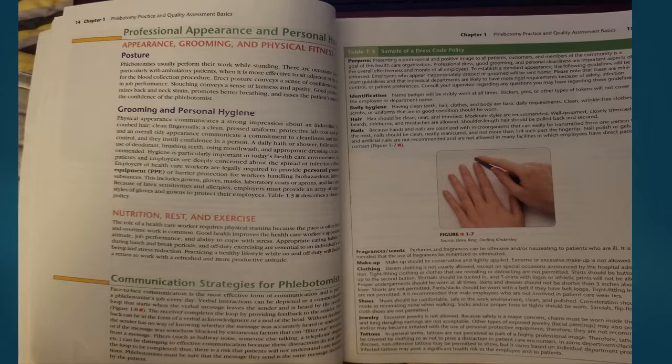This includes gowns, gloves, masks, laboratory coats or aprons, and face shields. Because of latex sensitivities and allergies, employers must provide an array of sizes and styles of gloves and gowns to protect their employees. Table 1-3 describes the dress code.